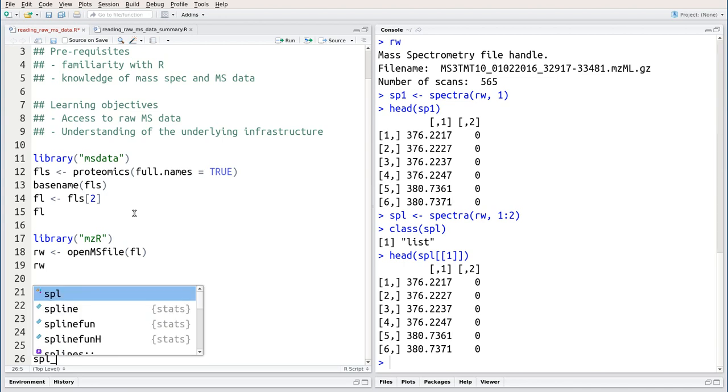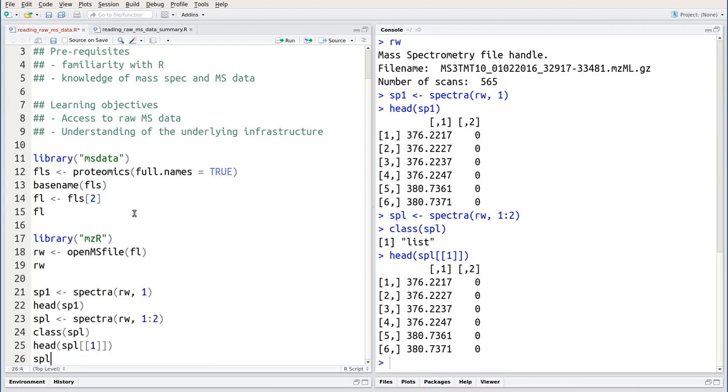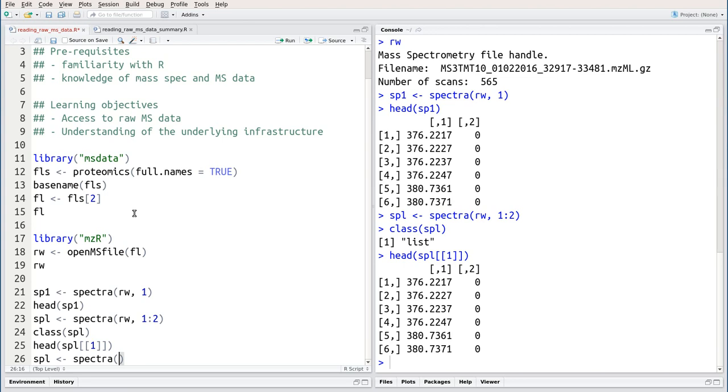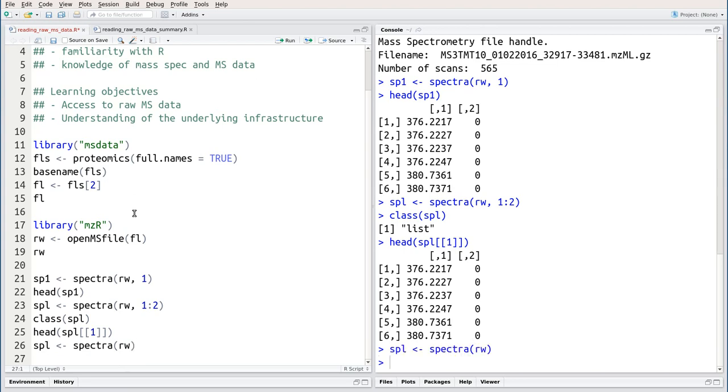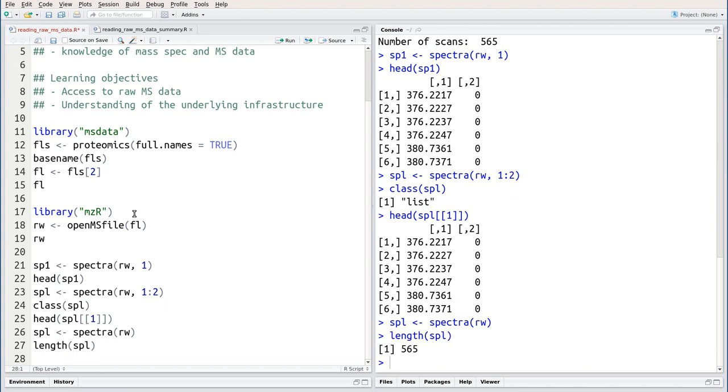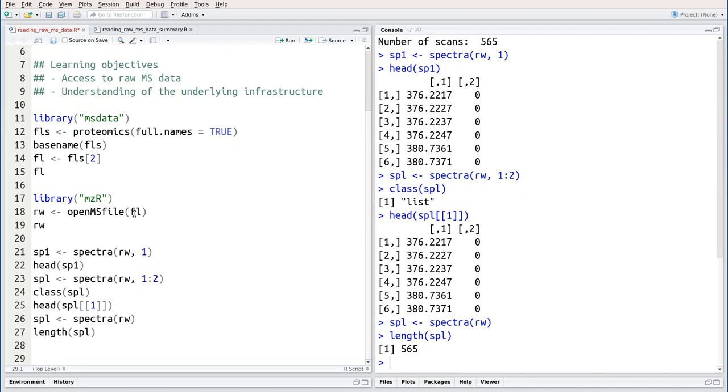Finally, if we wanted to access all spectra, we could ignore the second argument and just query spectra rw1. This would produce a list of length 565, one for each spectrum. Now this is the raw data, the individual spectra, but that is not enough.